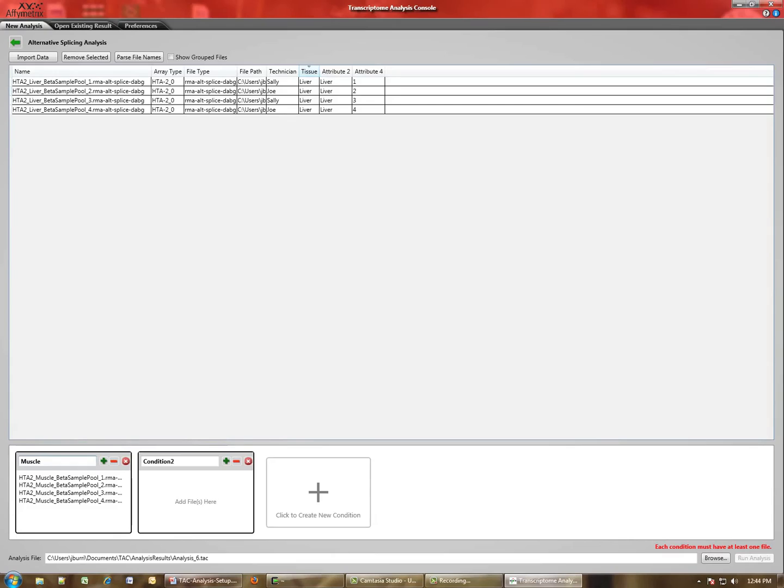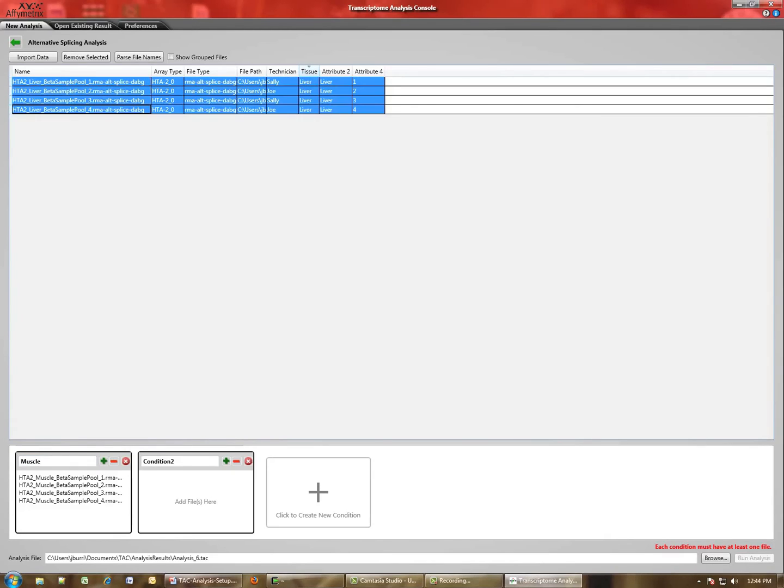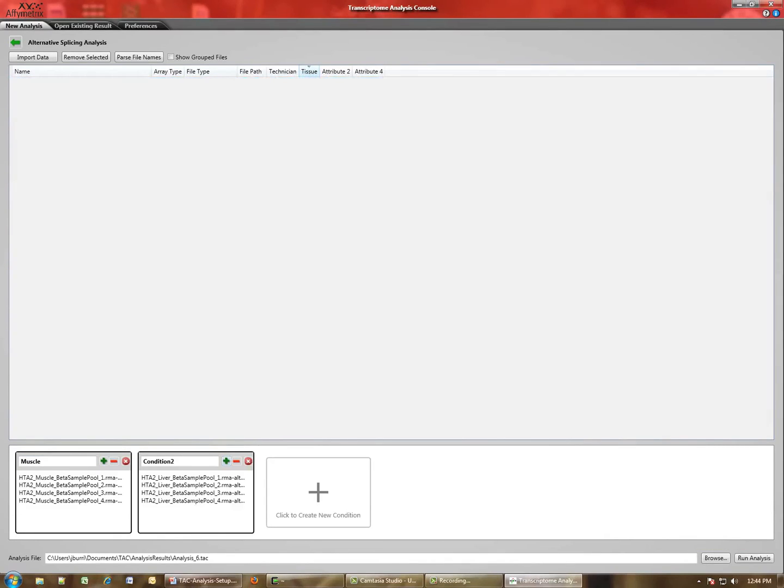We'll select the second four files, which are from Liver. Hit the plus. Rename the condition.